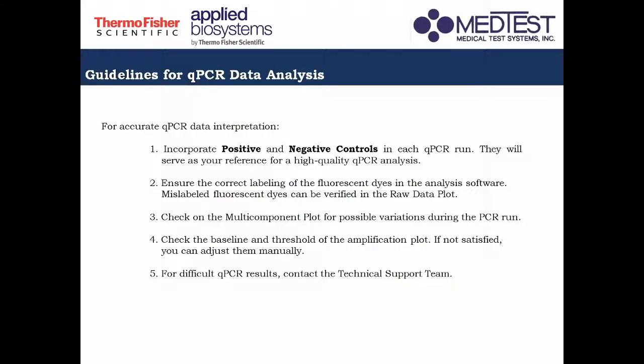And then another one is to always check on the multi-component plot for possible variations during the PCR run. So, yun, pag may mga bubbles or evaporation that happened in your PCR run, you will be able to tell them at the multi-component plot. And in that way, you would be able to know how to interpret well your qPCR result.